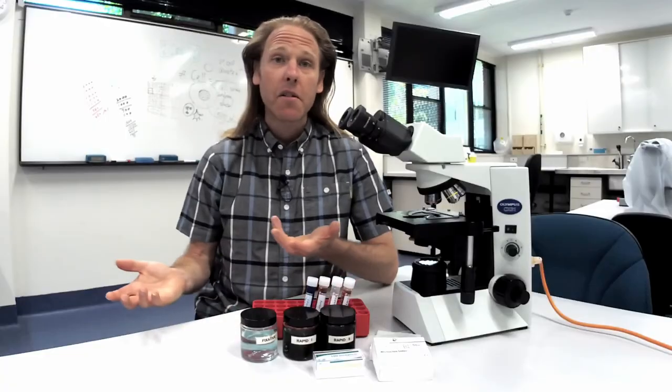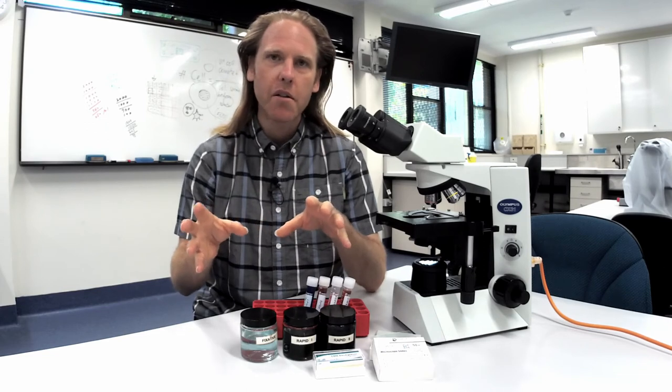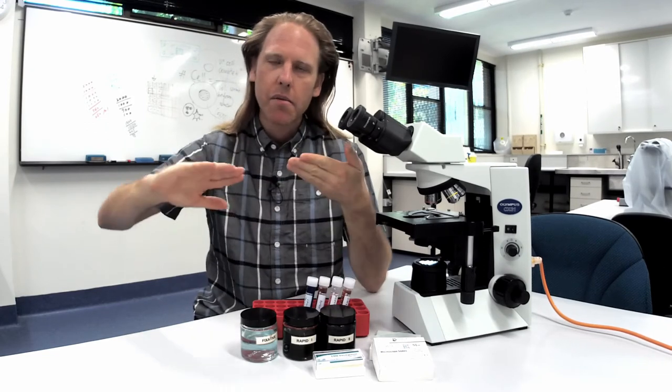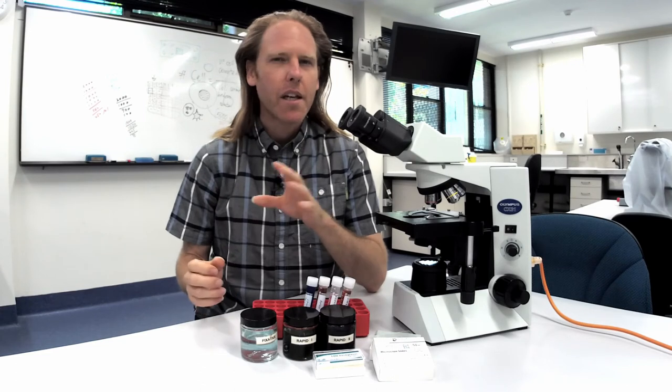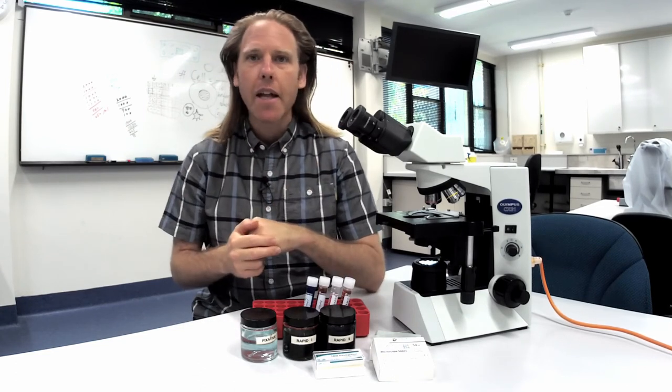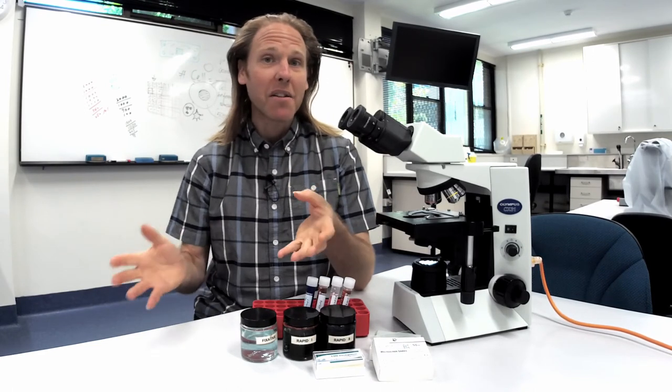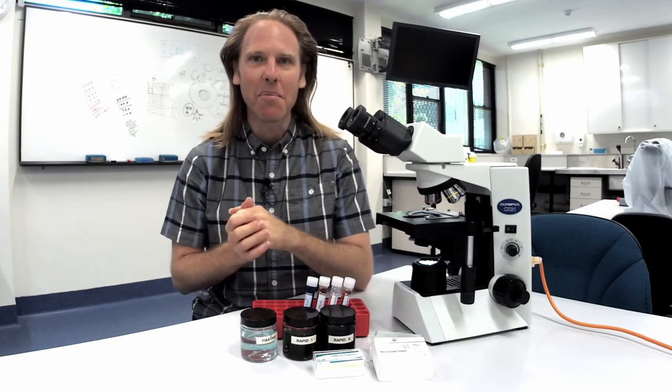And finally some general tips. With needle aspirates try to get two to three collections per site and make two smears per collection. Send in two to four slides per location or lesion if you can and stain one up in house so that you can check that it's of diagnostic quality and also make some notes and compare with a lab report when it comes back.